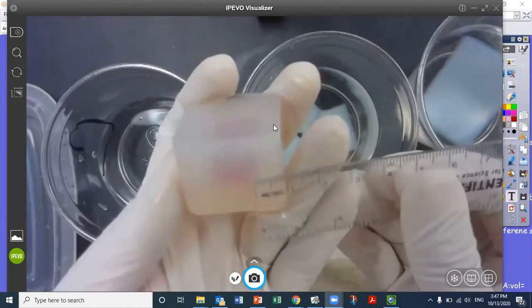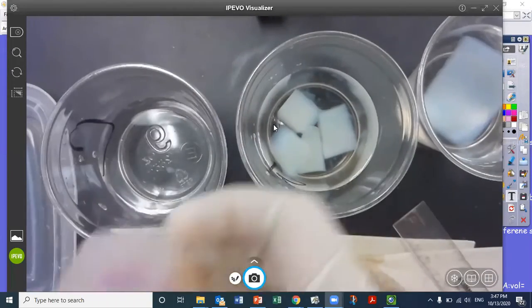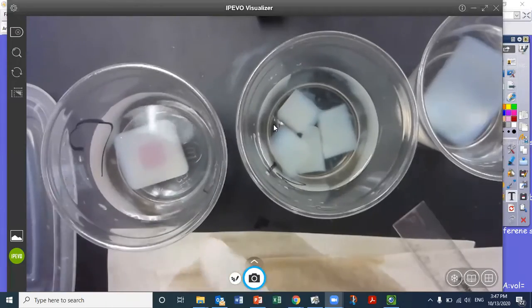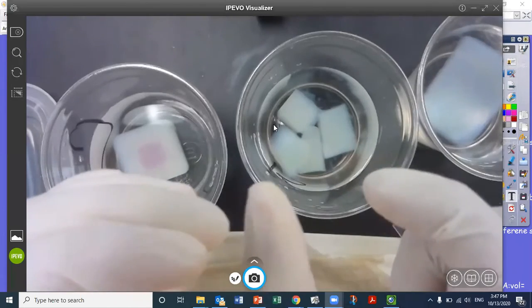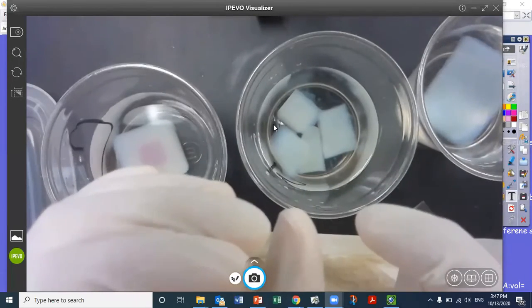Some of the sides are a little less, some of the sides are a little bit more based on the shape, but our diffusion depth is about 10 millimeters from both sides. That means that the actual distance, right, if you go 30 in total and you go 10 in from the right and 10 in from the left, the actual distance left of the base of the pink is only 10.